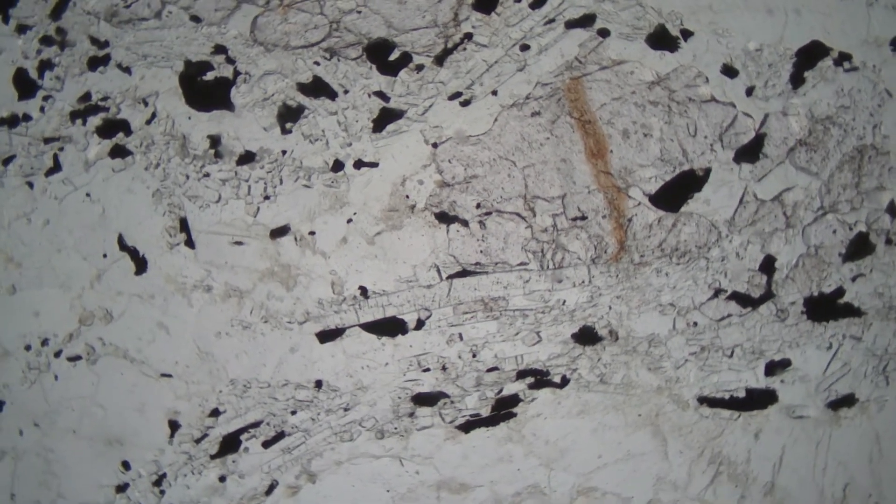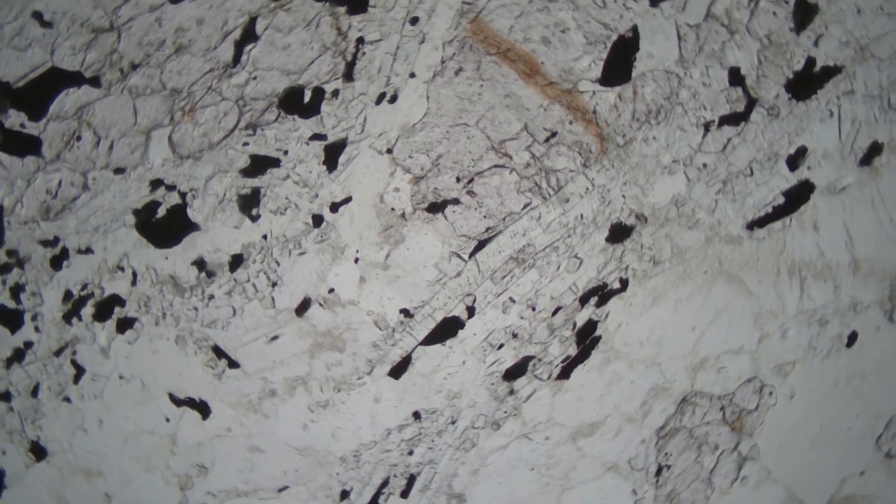The high relief clear grains are needle-like sillimanite and blocky garnet, and the background material is quartz and feldspar.